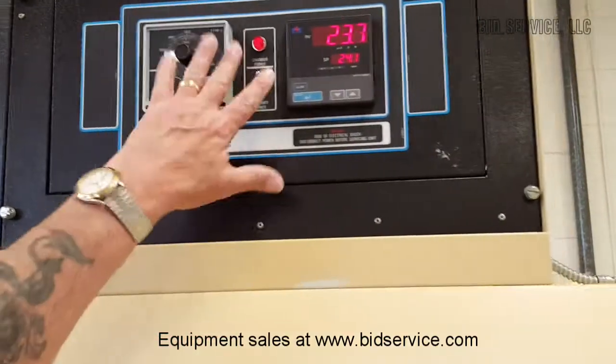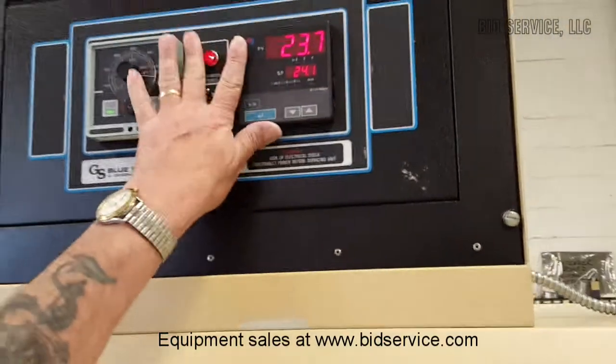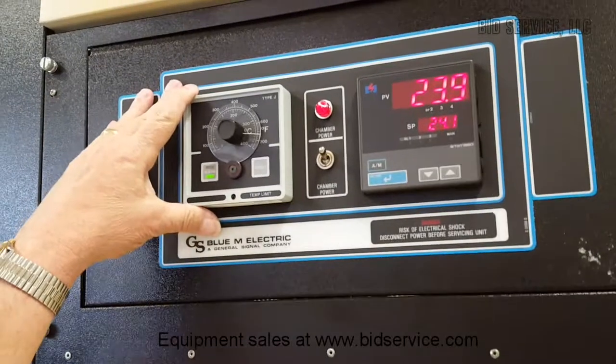We have a pilot light here, we have the main controller here, and we have our over-temp here.